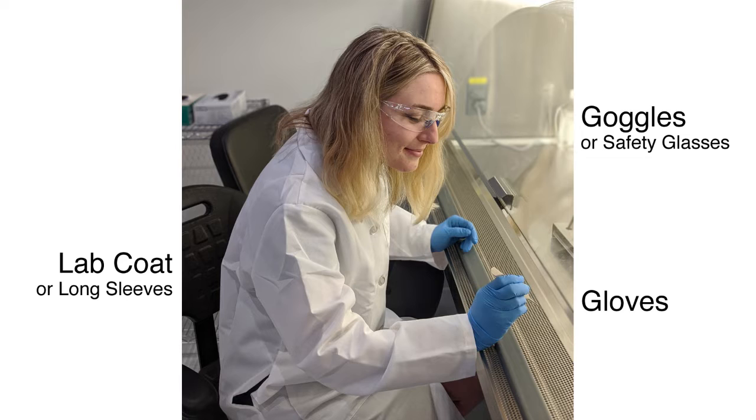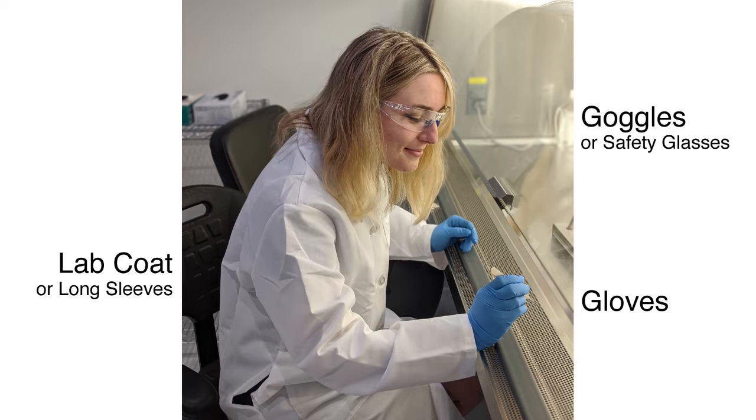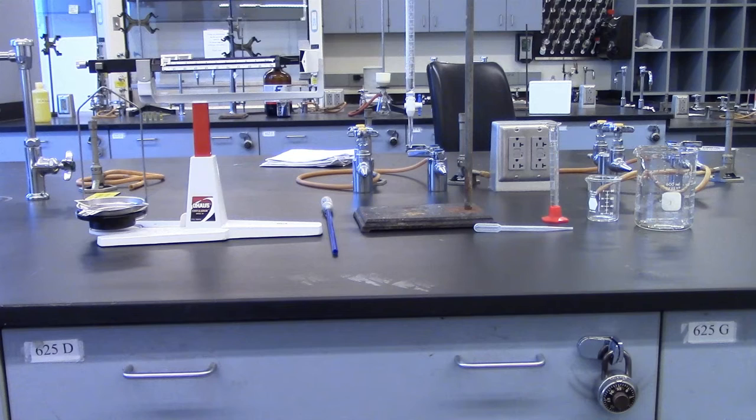Safety glasses or goggles, lab coat, and closed-toed shoes will be used. Gloves are optional since distilled water will be the only substance used.